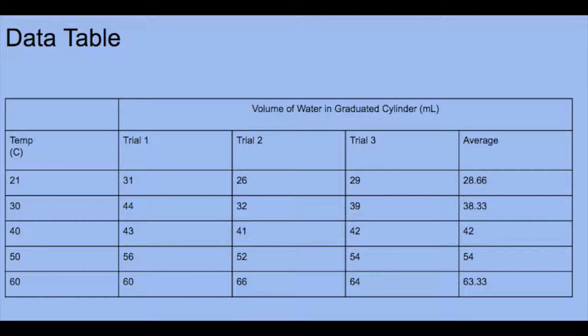You can see in our data that we did 5 different levels and 3 trials each. From each level, we increased the temperature 10 degrees, and we saw that on average, the volume of water increased. There was a point from 30 to 40 where the increase was smaller than the rest, but that may be due to issues with the experiment, such as the plug cap and the heat changing, since it was difficult to move the heat directly from the hot plate into the middle flask.